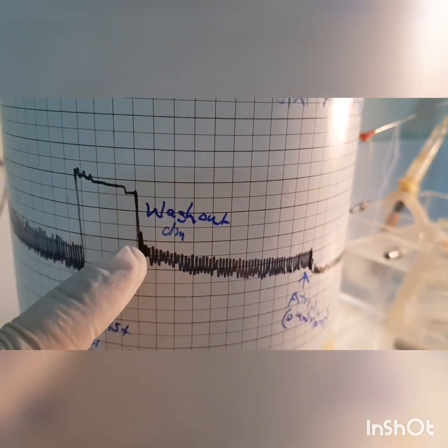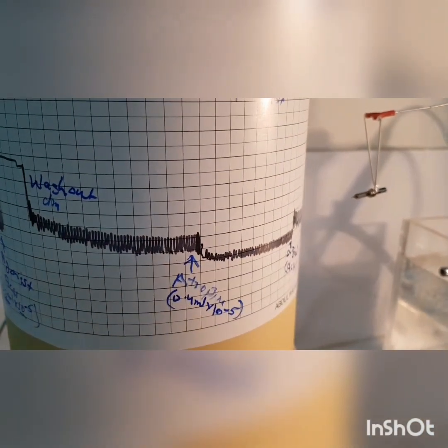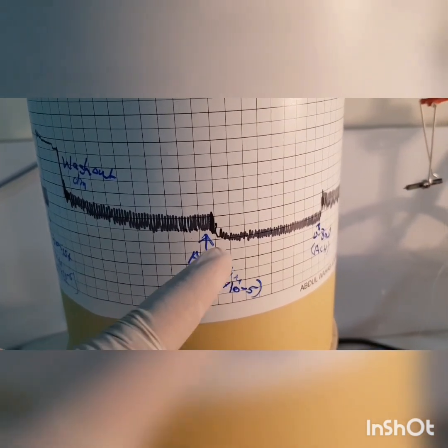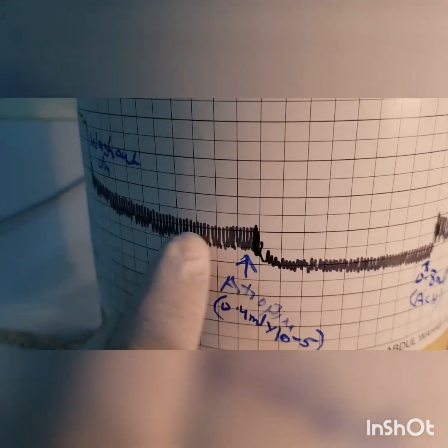Then we wash out the drug. Again there is normal contraction. Then here we give 0.4 ml of antagonist. This is the effect of the antagonist. Normal activity.